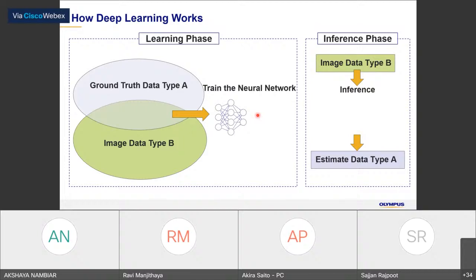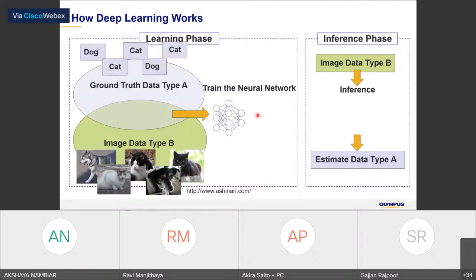To train this neural network, we need the ground truth and also the image data, in a very simple way: this is dog, this is cat, cat, dog, cat.